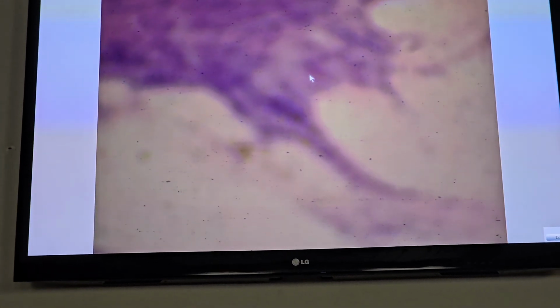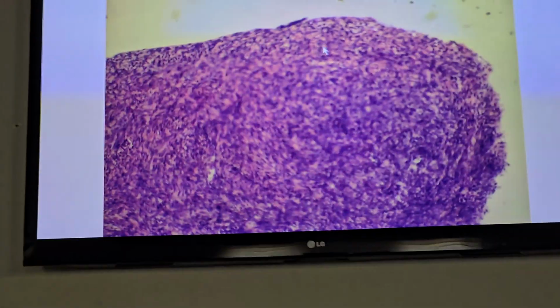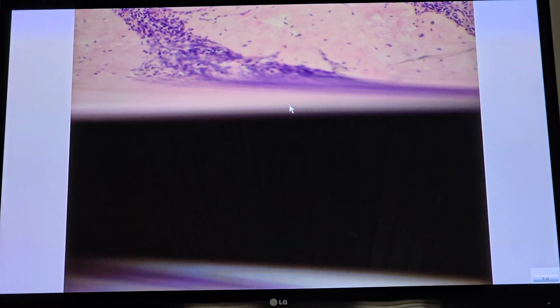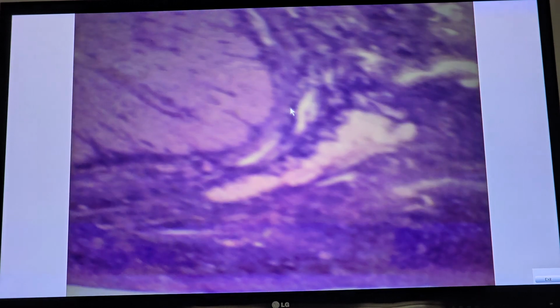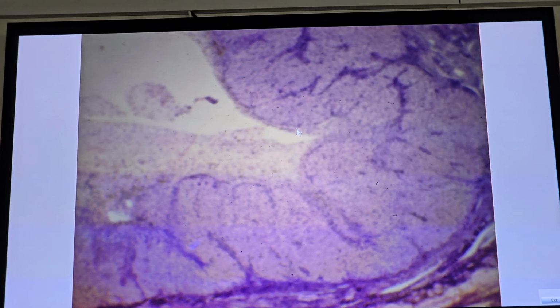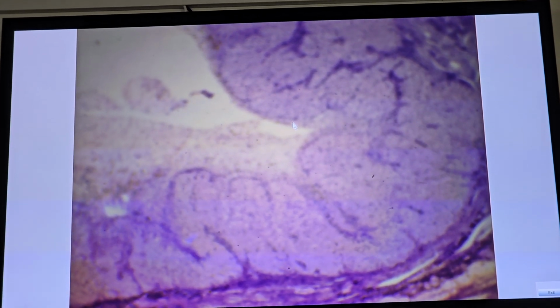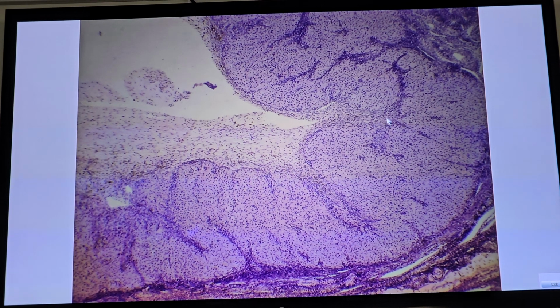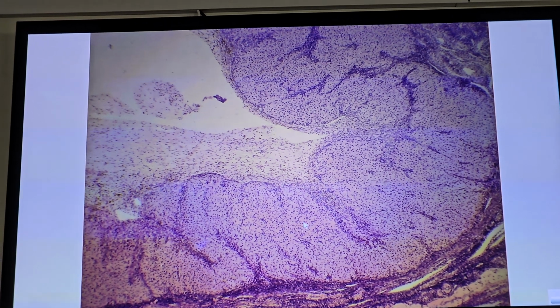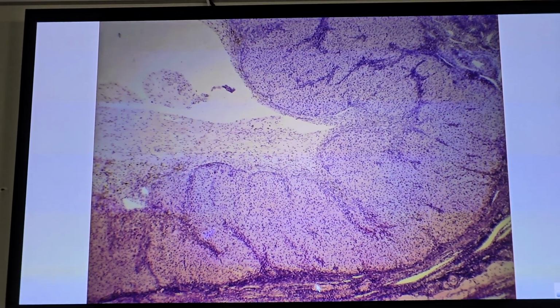Second section in the ovary, but for corpus luteum. After ovulation, the remaining granulosa cells and theca cells reorganize to form large temporary endocrine organ called the corpus luteum. This is the corpus luteum, consisting of granulosa cells and theca cells.